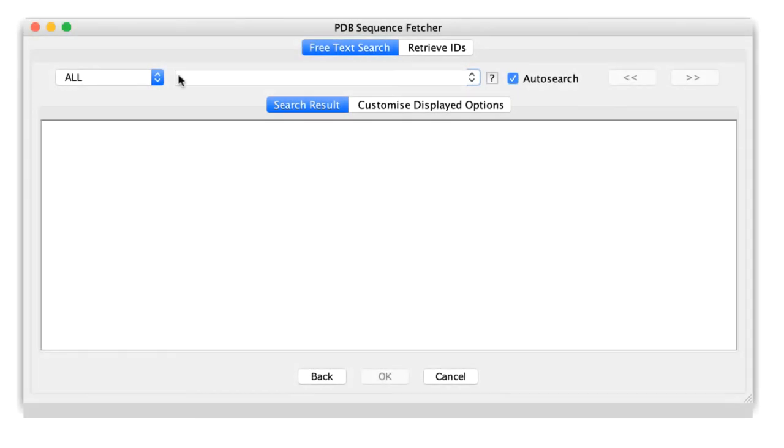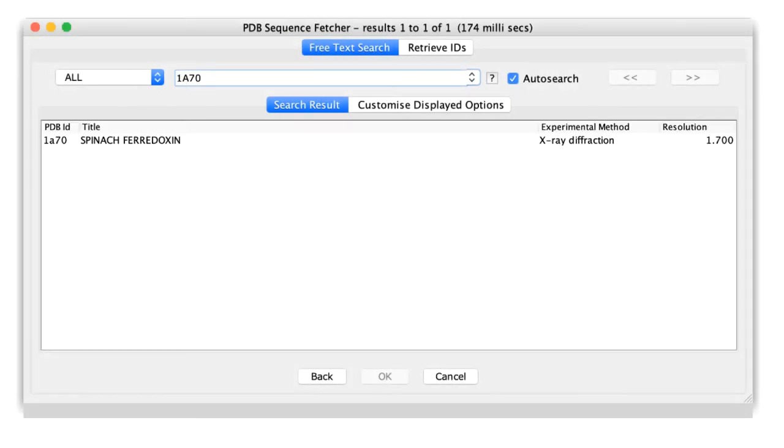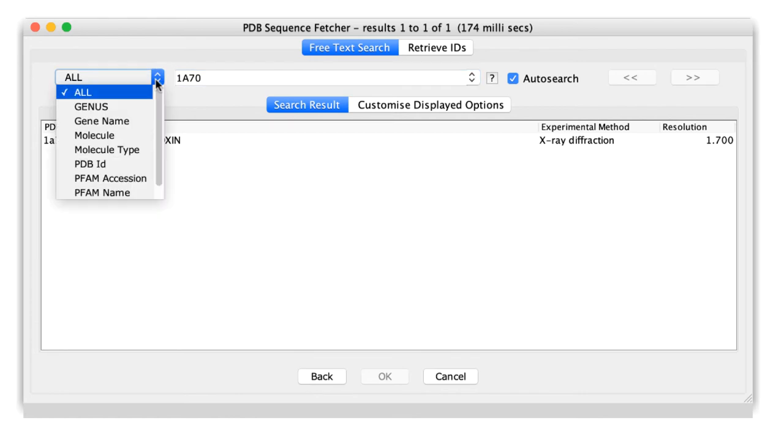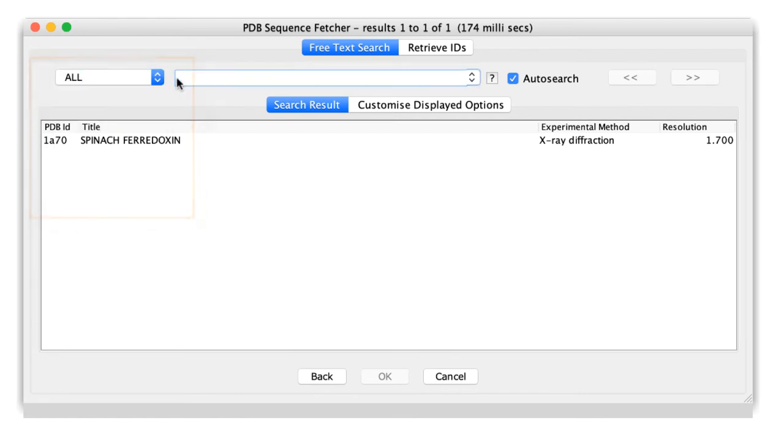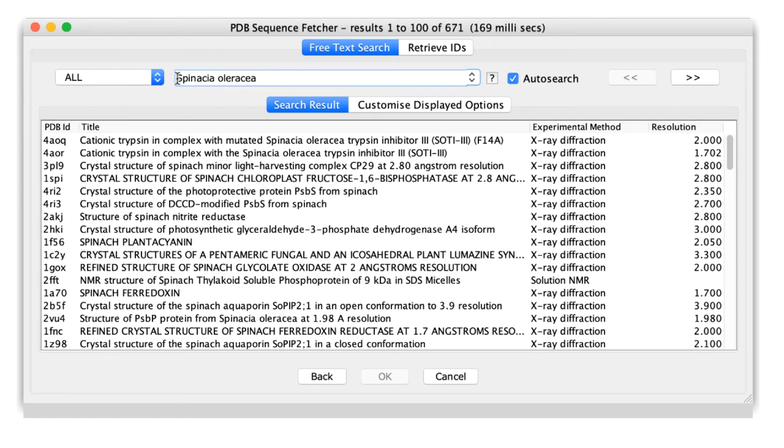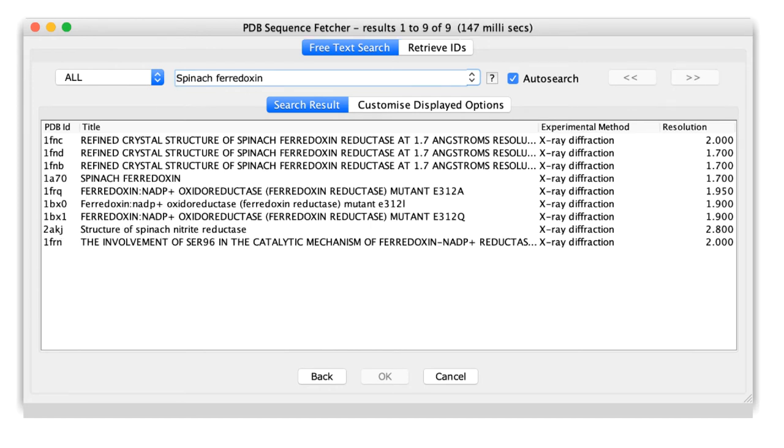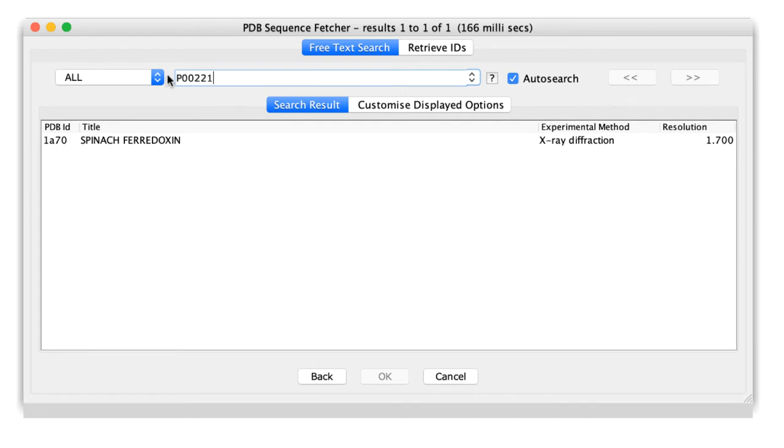In the PDB sequence fetcher, as well as using the PDB ID to fetch sequences, a variety of other identifiers are recognized, including the organism's name, the molecular name, mutation IDs, and the UniProt IDs.